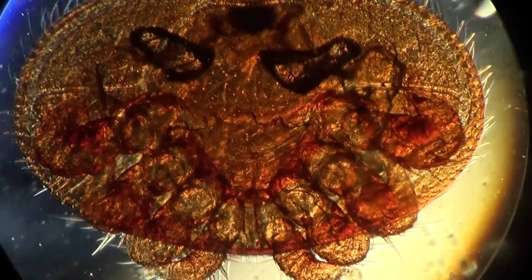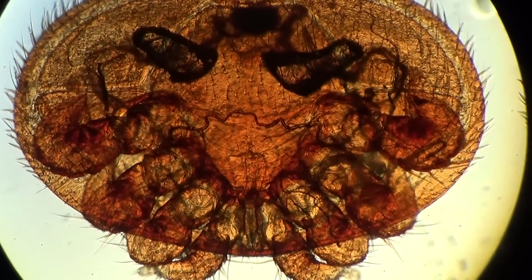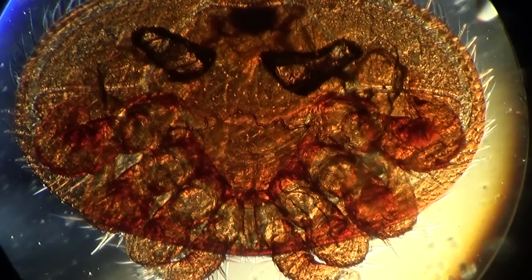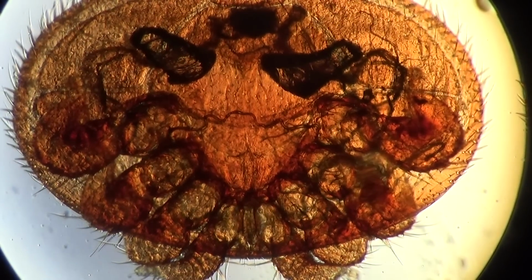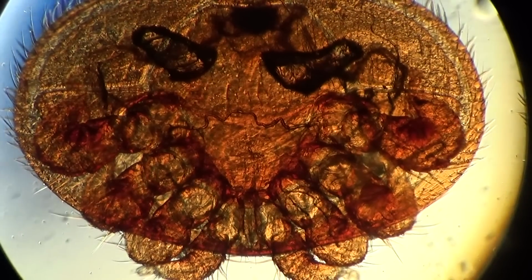Oviposition can be done in 3 stages, three times, and the total number of laid eggs is up to 38, from 1 to 38. On average, 7-10 eggs can be laid by the female mite. Eggs are laid inside the brood cell.